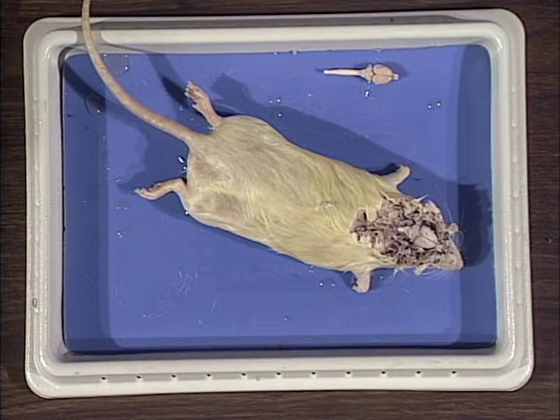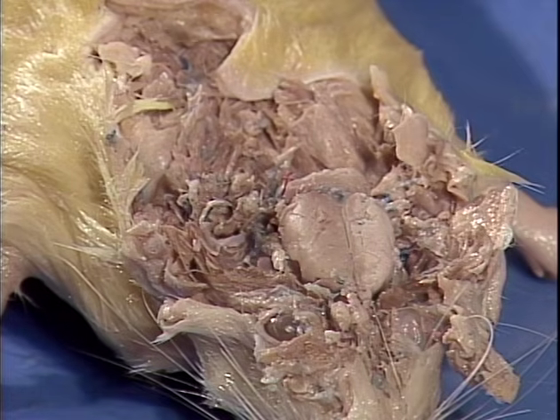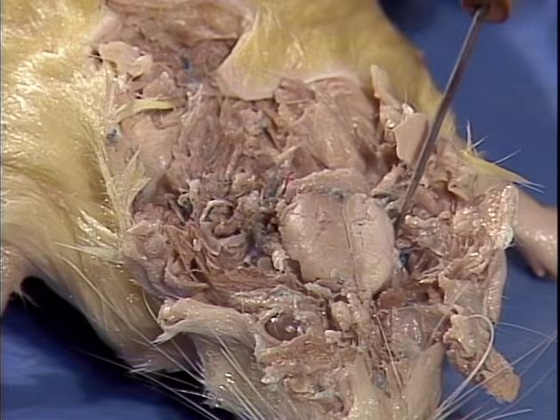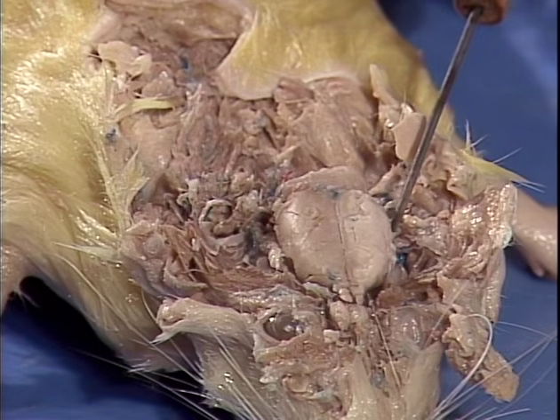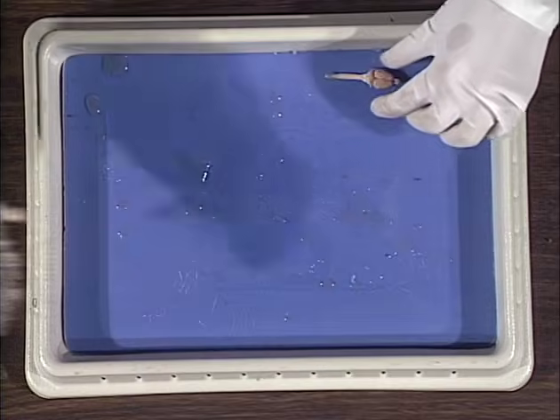The cranium must be opened to expose the brain. This requires a great deal of time and care. We will examine one that has already been opened. To really study the brain structures, we need to take this brain out of the cranial cavity and examine it. I have one here for us to look at.